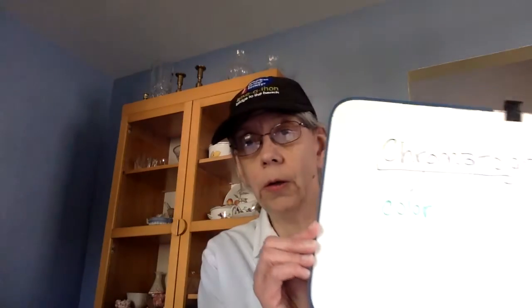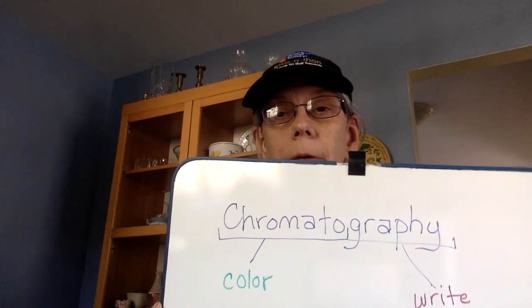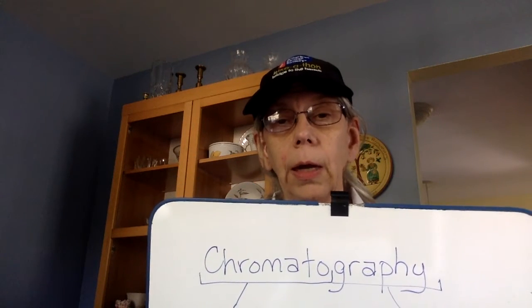Okay, we're going to talk about a process that gets used in many situations. It's basically a chemical process using physical properties of substances to separate things that are in a mixture. The process is called chromatography. And it's a big word made out of little pieces.